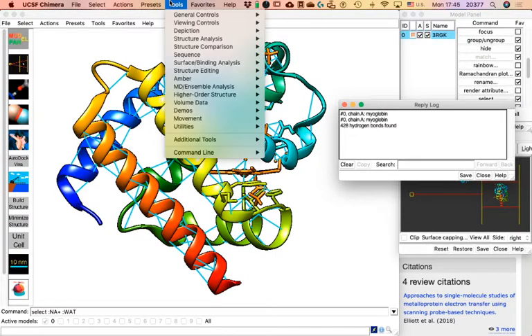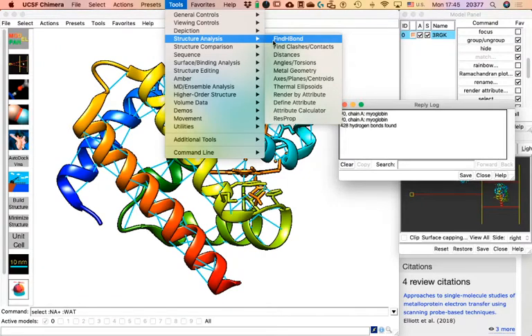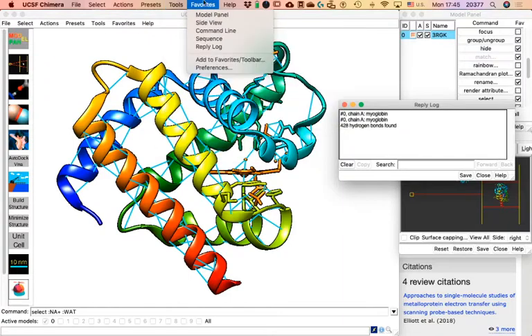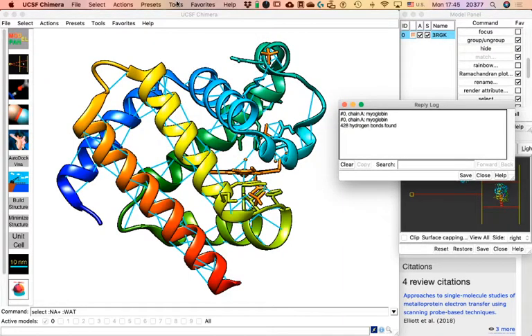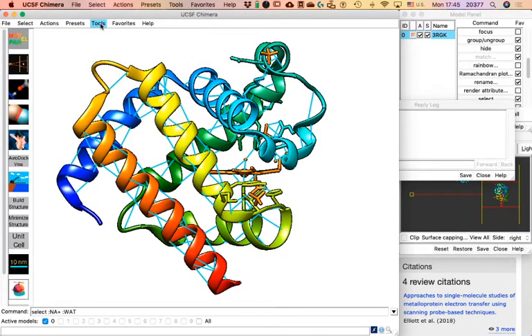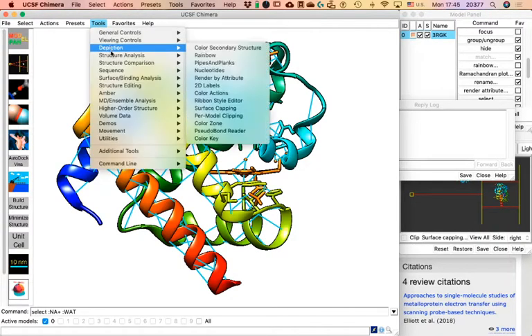Go to Tools > Structure Analysis > Find H Bonds. Note that I have two menus — one on top and one inside the application — but they are technically the same. Tools > Structure Analysis > Find H Bonds.